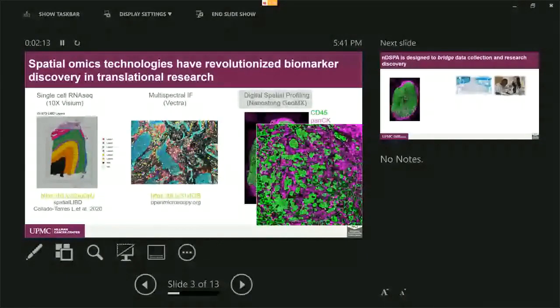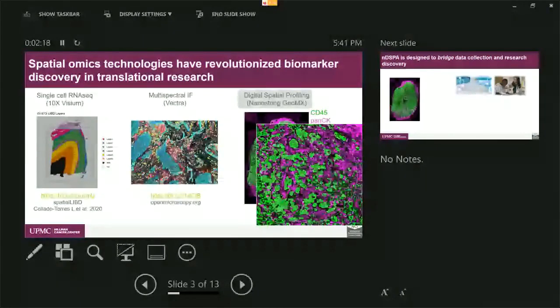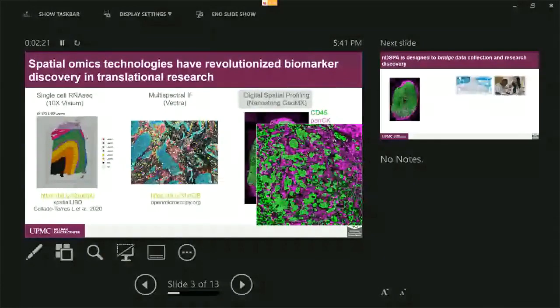A zoomed view of Nanostring DSP is looking like this. As you can see, we see two colors. And then for the green color, those are actually CD45 color. And for the PanCK, those are the purple ones.